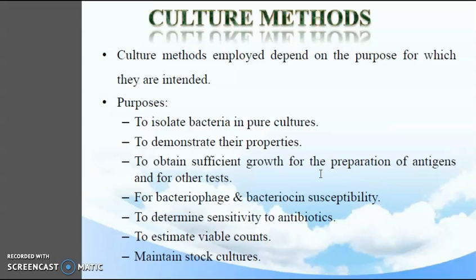In the clinical laboratory, the indications for cultures are mainly to isolate bacteria in pure cultures, to demonstrate their properties, to obtain sufficient growth for the preparation of antigens, and for other tests. It's mainly involved in the development of vaccines and immunological tests. Then for bacteriophage and bacteriocin susceptibility.